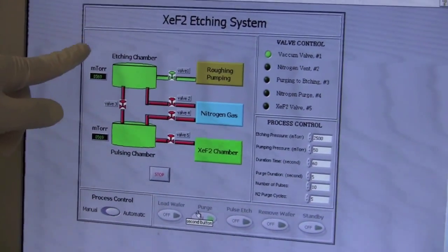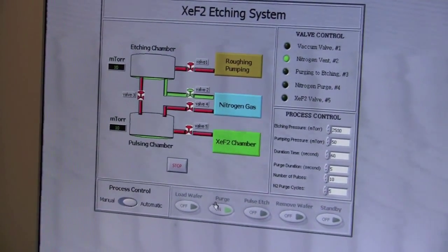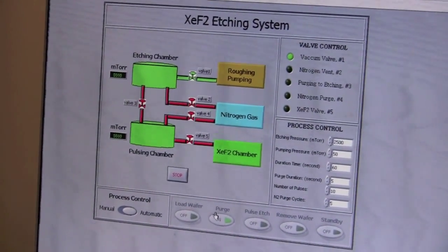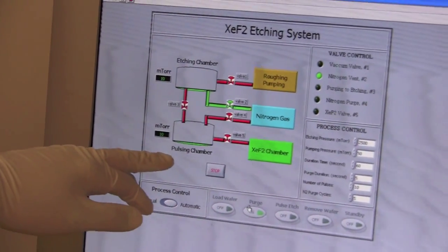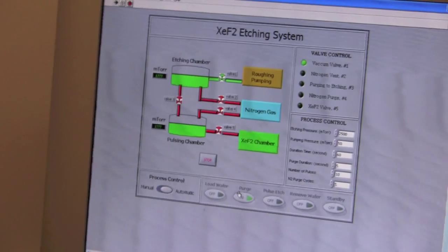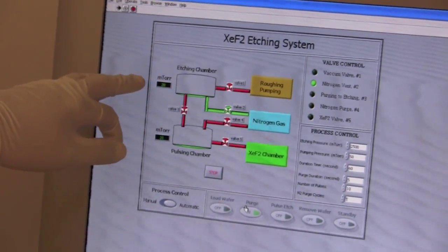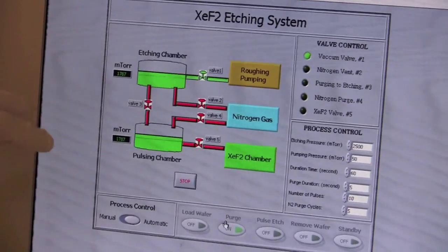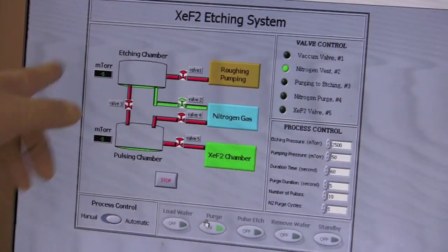As you see in this diagram, we have an etching chamber, a pulsing chamber, roughing pump, nitrogen gas source, and a xenon difluoride chamber. Now this system describes it this way, but it's not actually this way. We have an etching chamber where your sample is placed. It's this big thing here in front. And this pulsing chamber doesn't really exist. It's actually using the xenon difluoride bottle itself as an expansion chamber, so it's kind of a misnomer here. Also, we only have one pressure transducer, and it's the one attached to the etching chamber. So you'll always see the pulsing chamber and the etching chamber reporting the same pressure because of the shared transducer that we have. And of course, it's the same transducer I mentioned earlier, the one that drifts.